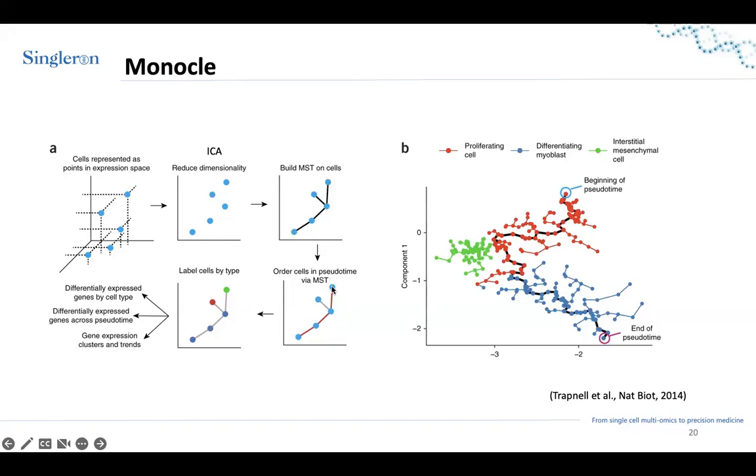And the starting point is assigned a value of 0. And the end one is assigned a value of 1. So basically along this trajectory, you start from 0, you end at 1. And this trajectory is basically a measure of time, but it is not a real time. That's why it is called pseudotime. So that means that if a cell starting at pseudotime 0, if you let the system evolve, if you could do that, because your experiment is one snapshot, you have taken the transcript, the mRNA, and that's it.